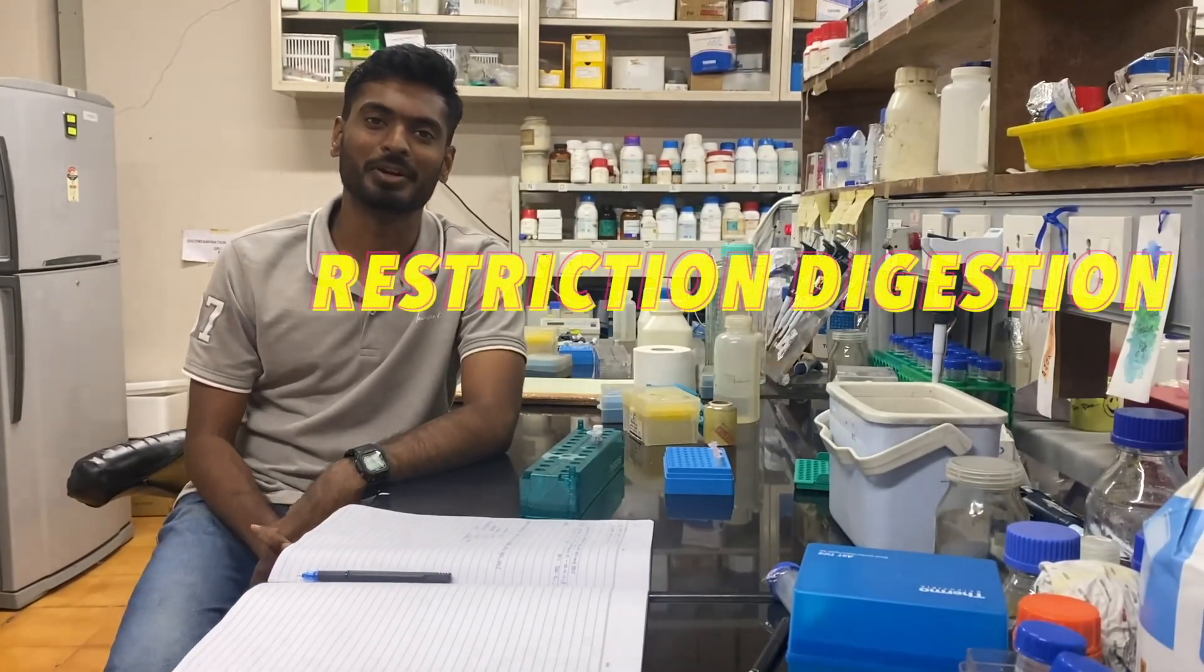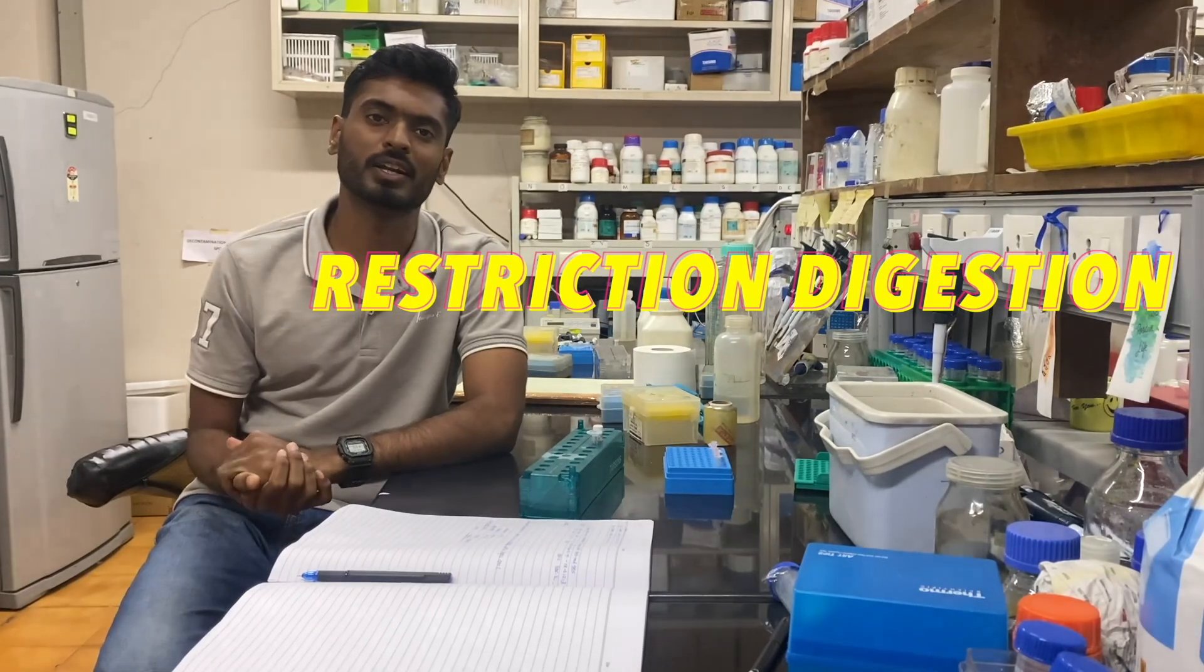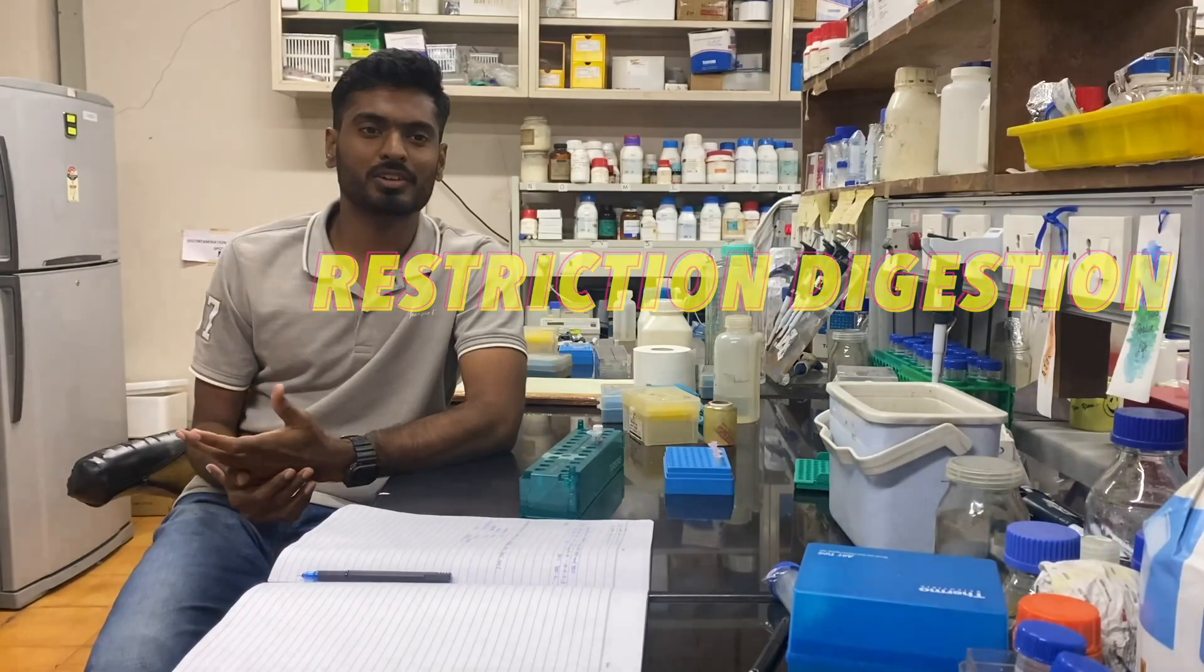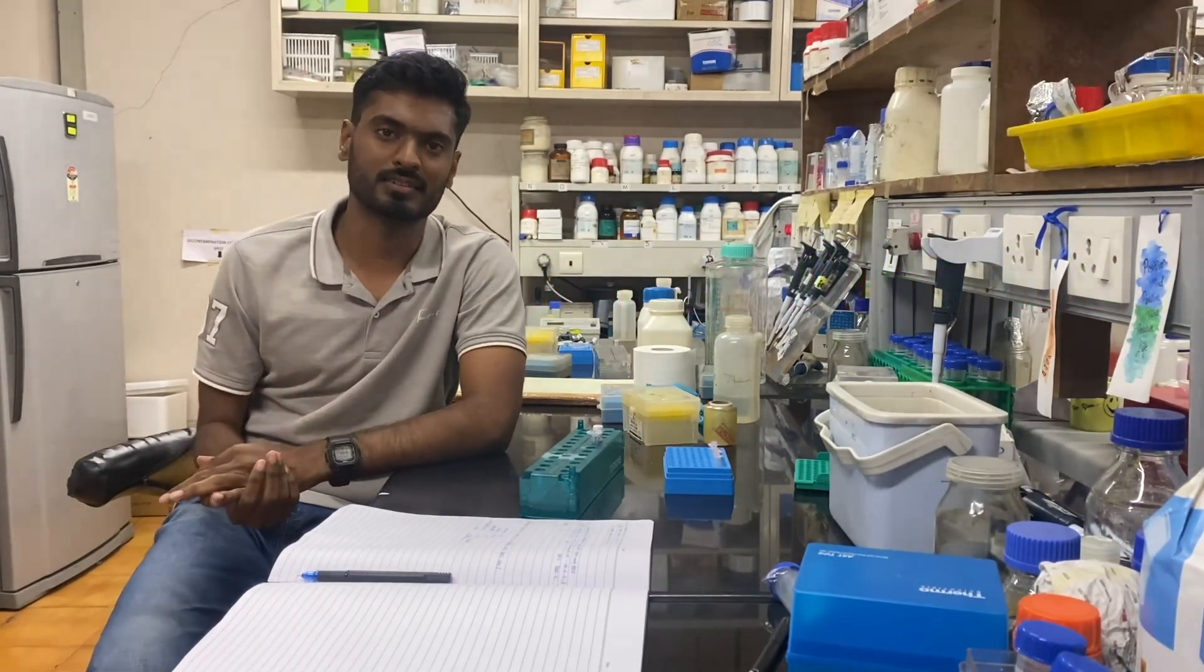Hello and welcome to another video. In today's video we will be learning about how to set up the restriction digestion reaction. So first question is what is restriction digestion? What do we mean by restriction digestion?